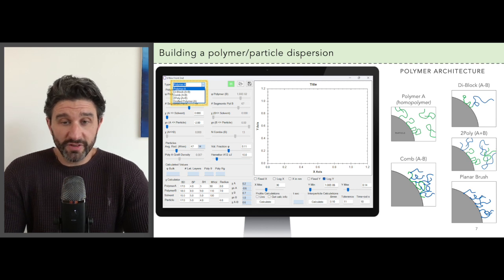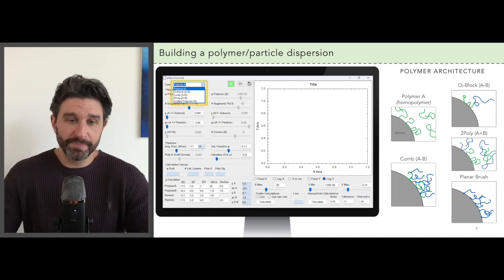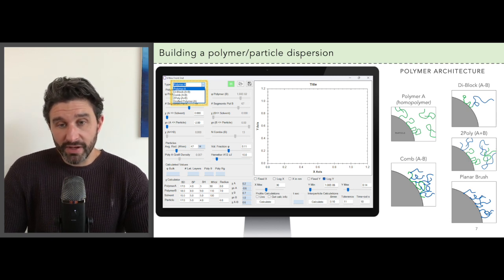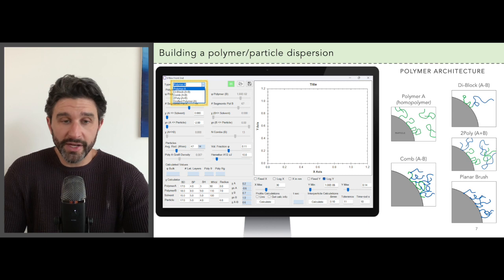The first of course is a homopolymer, that's just a standard long polymer. You can also choose a diblock copolymer composed of A and B blocks, and then you can tune the size of those blocks as you wish later on.